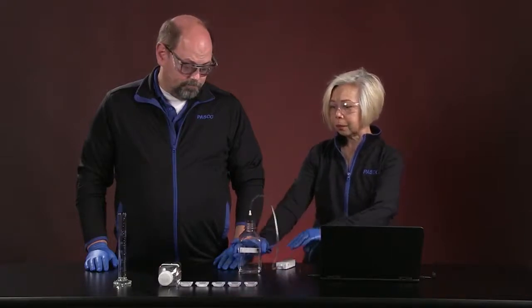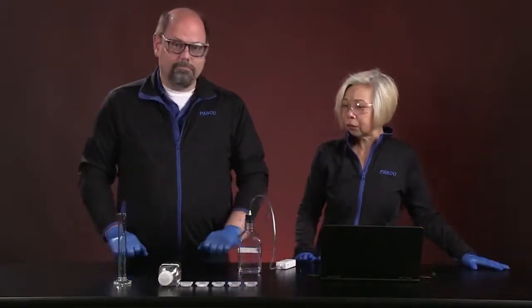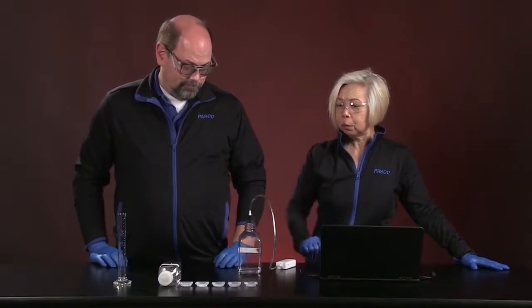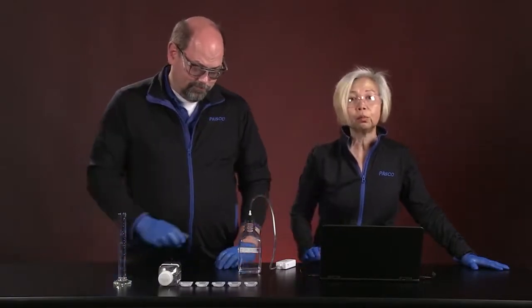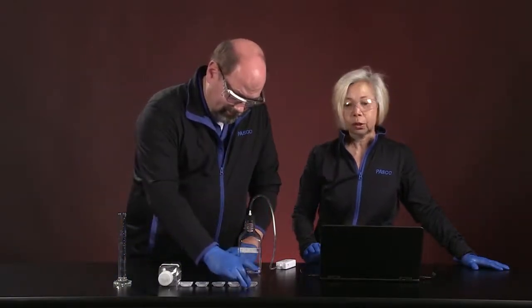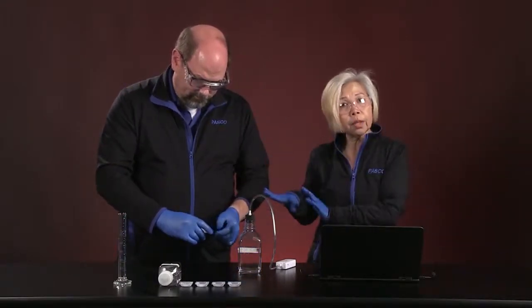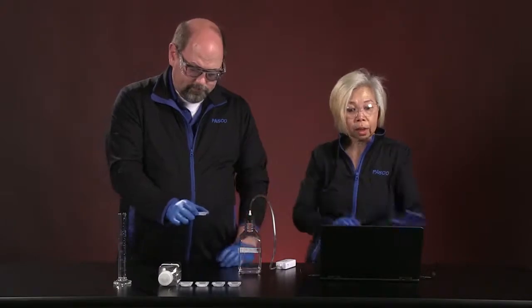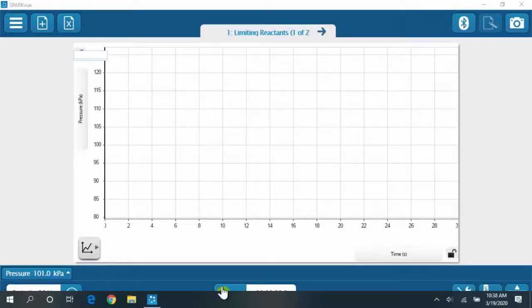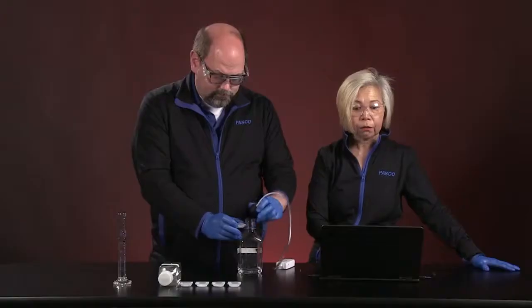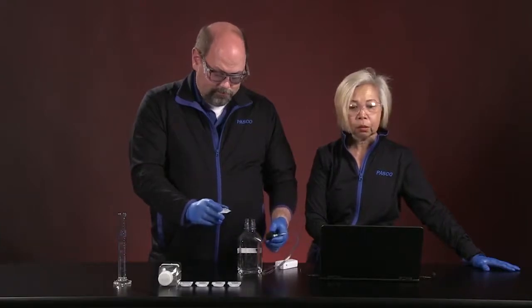So Roger, since you are the stronger one of the two of us, how about you pick up our first sample which is 0.1 gram citric acid. And this is one of the reasons why you want to do this with a partner, because while somebody is setting up and running the experiment, somebody gets to press the start button and that is my favorite job. So let me know when you're ready, dude.